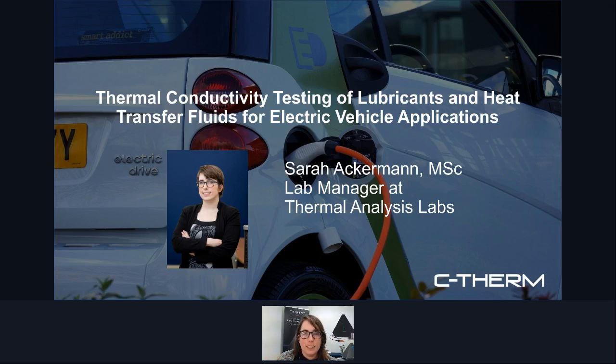So with that briefing on the Trident thermal conductivity instrument and its capabilities out of the way, we'll take a look at the technical content for today's talk.